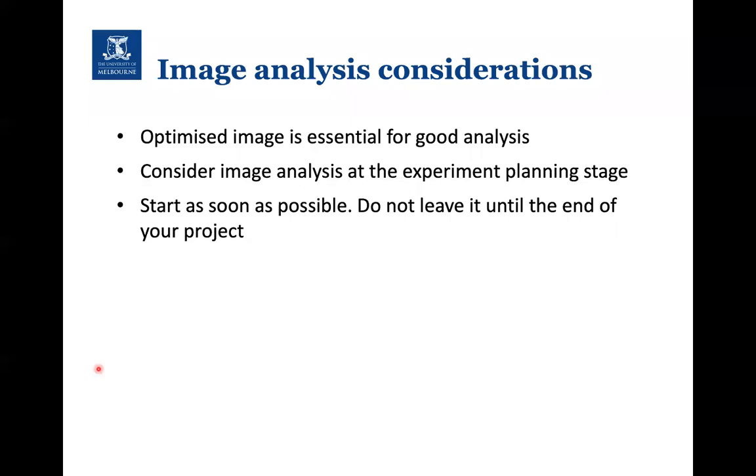Okay, so image analysis considerations. It's always worthwhile, before you start your experiments, thinking about what the analysis is that you want to do. We've got to really consider that at the start in the experimental planning stage, and start that as soon as possible. Don't leave it to the end of your project.